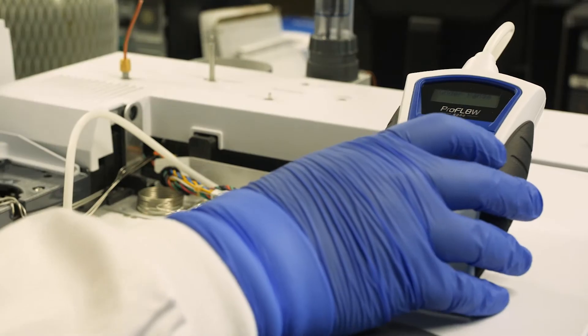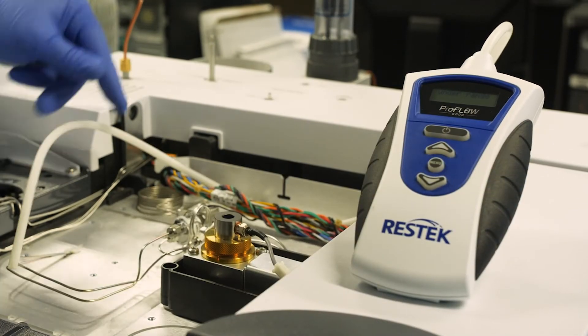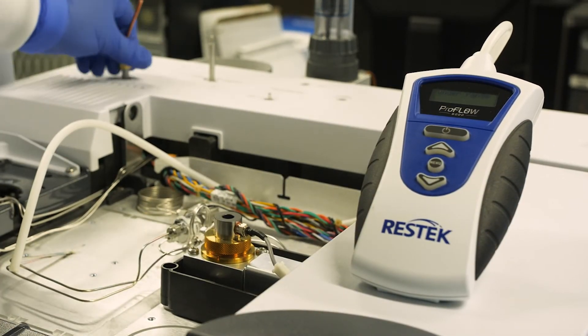Let's begin with the why. One of the biggest reasons to have a standalone flow meter is for troubleshooting. Whether you're seeing issues with an analysis you've performed hundreds of times or are developing a new method, it can be useful to have a separate calibrated tool dedicated to measuring gas flow. Its flexibility lets you measure flow throughout the instrument, making it perfectly suited for part of your routine maintenance schedule.